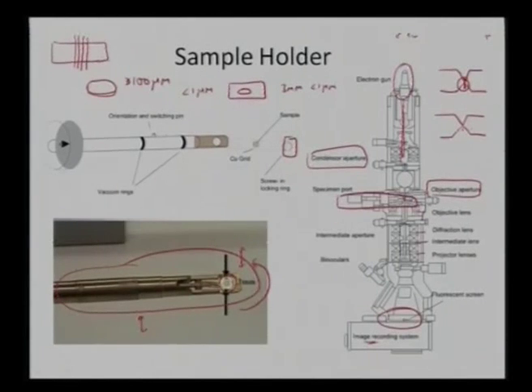Or I can also utilize something called ion beam milling. For conductive samples, I can use something called twin jet polishing. I am sending two jets, one on each side, to start eating away the material and make it transparent to electrons at the center. Once I create a hole, the part near the hole is transparent to electrons. Seeing it from the top view, it will look like a disc with a hole in the center. Just the area nearby that hole is now transparent to electrons.